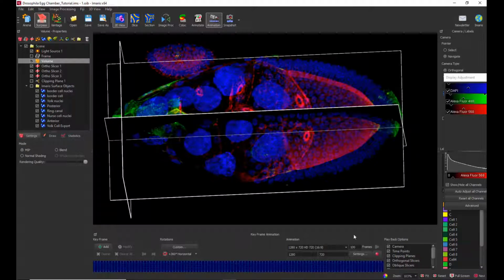Of course, the implication of it is the speed of transitions between keyframes you added. Later on, I will show you how to adapt the number of frames to the number of keyframes you added. As a starting point, you can assume that the transition between your keyframes should last around 1 second or at least 1 second.